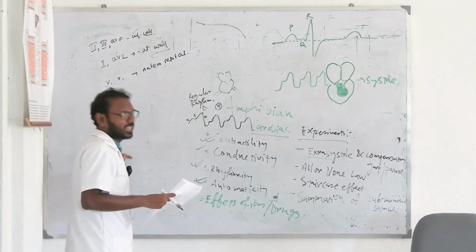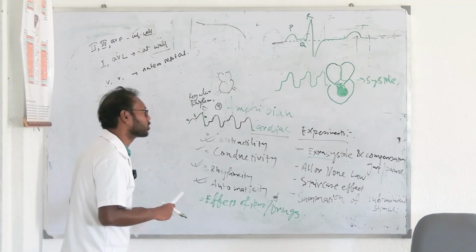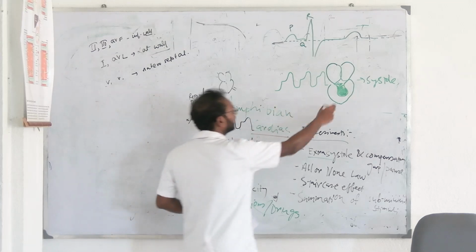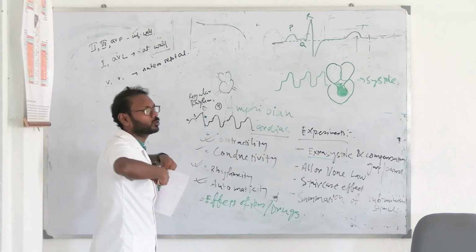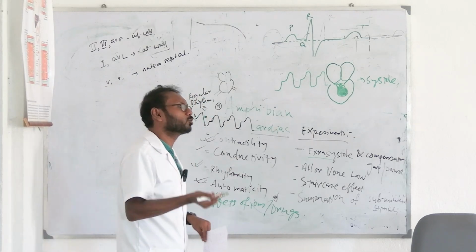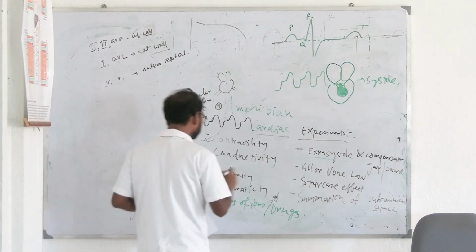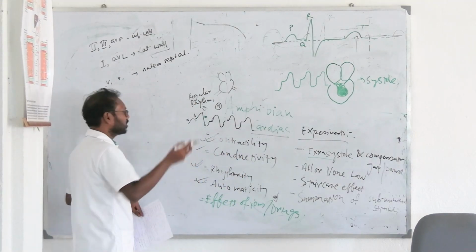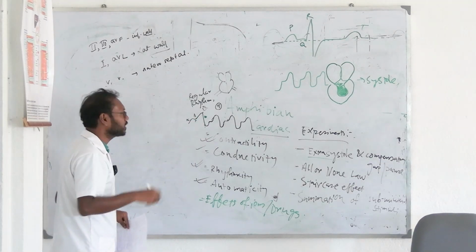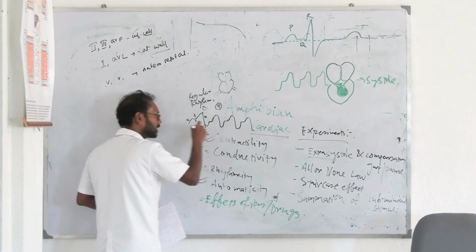Suppose I wrote one extra thing here, which I just mentioned, what did I write? Electrical board, okay, and electrodes. So this electrical board and electrodes are actually connected with this frog heart. In the picture there, two electrodes are put on both sides of the frog heart, okay? After the 2 electrodes are put, an electric circuit is formed, and through that electricity is given or run, so that in 3 areas, when the atrial systole is completed, first point, second point when the ventricular systole is completed, and third point in between the ventricular systole, okay?